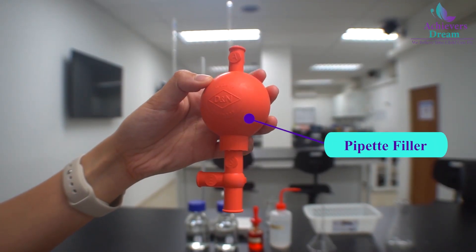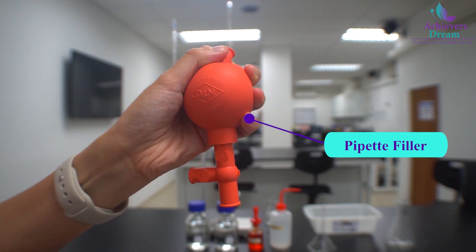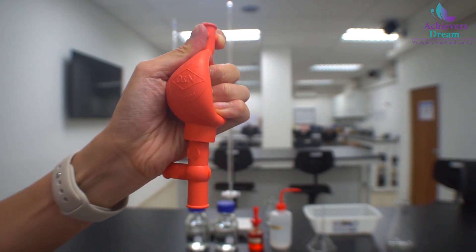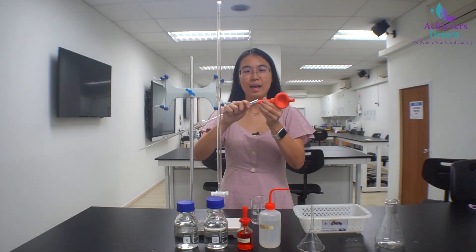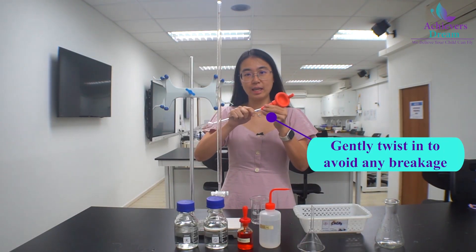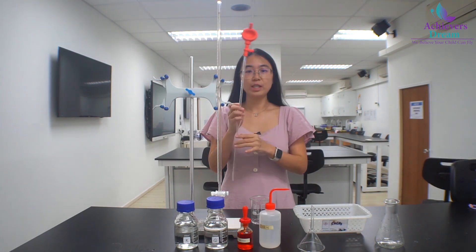We need to use a pipette filler to suck up the solution. Press A and deflate the pipette filler. Hold the pipette near the top and gently insert it into the bottom of the pipette filler. Don't push it too hard as you might break it and injure yourself.